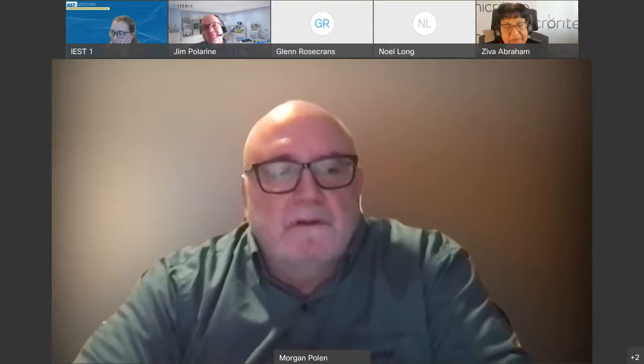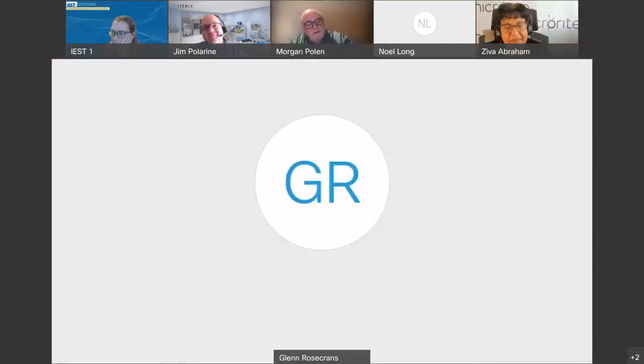I'm very curious. It's just we have clean rooms at Goddard that have been there 10, 20 years, and obviously some of the areas are difficult to reach, and you're going to have difficulty getting people to actually climb inside and do the physical cleaning. Some of the entry areas are big enough, but you're still going to be limited by grates and bends and such, so you're not going to be able to get to certain areas. Sure.